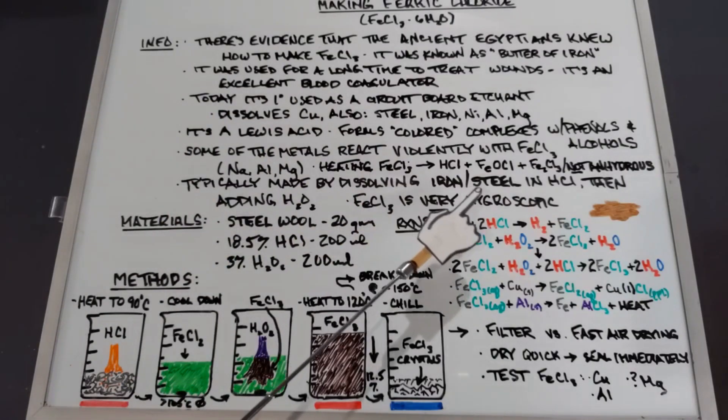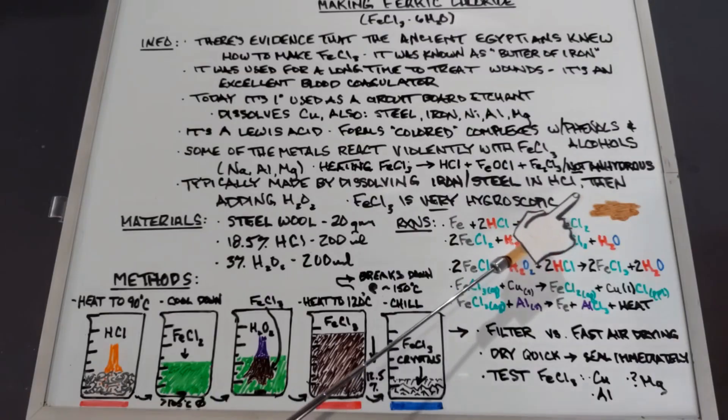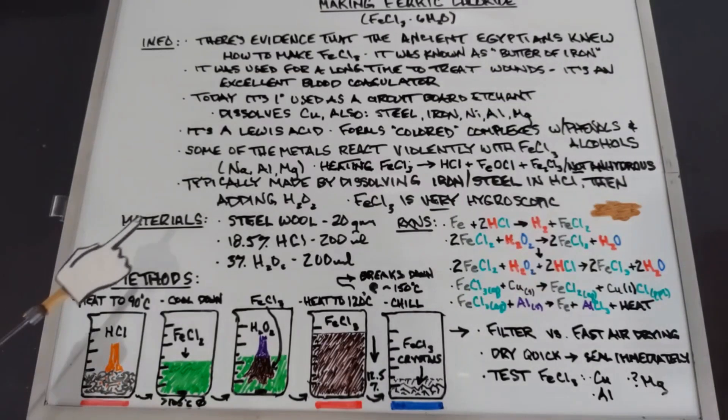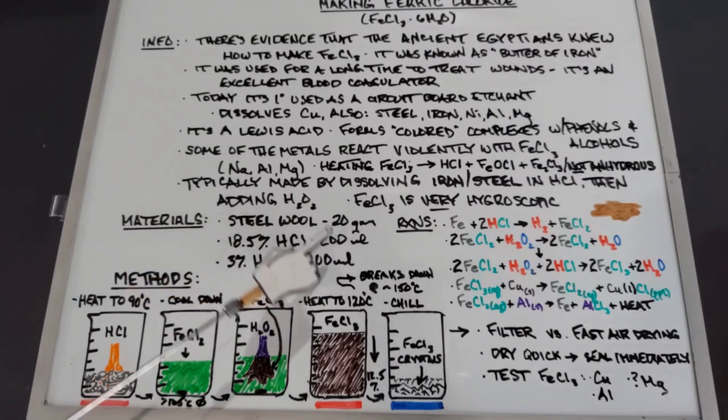Ferric chloride is very hygroscopic. If you leave ferric chloride crystals out for very long at all, they'll absorb so much moisture that they'll turn into just a brown puddle. For our materials we'll need 20 grams of steel wool, 200 milliliters of 18.5% hydrochloric acid — which I'll need to make — and 200 milliliters of 3% hydrogen peroxide.